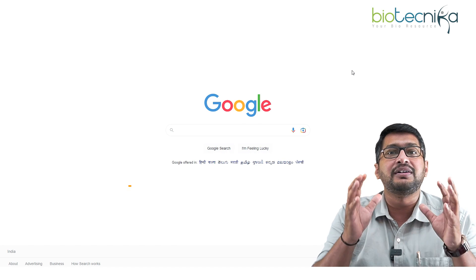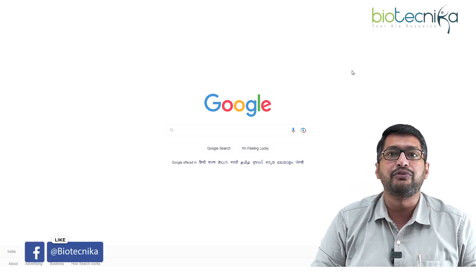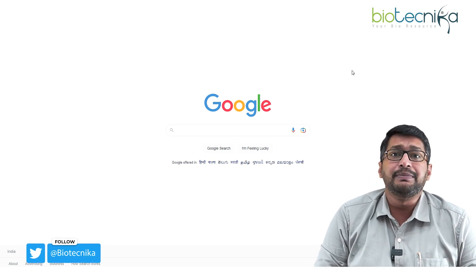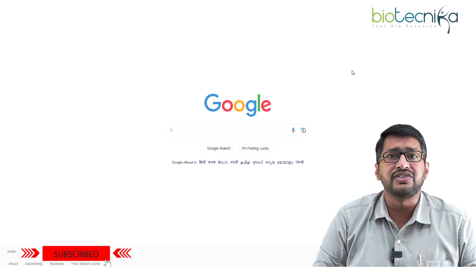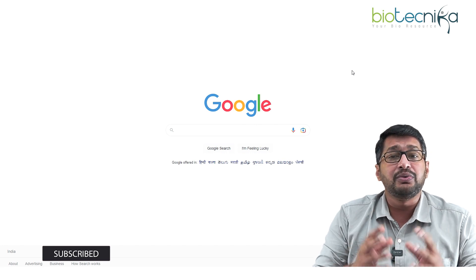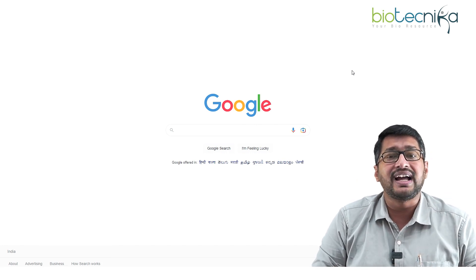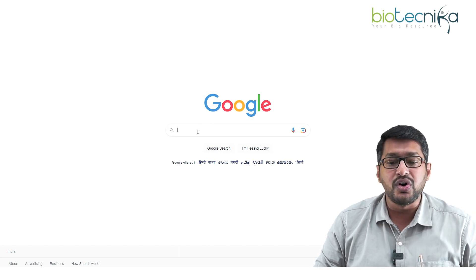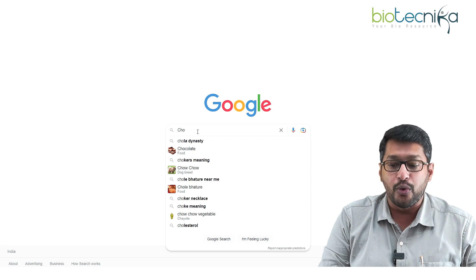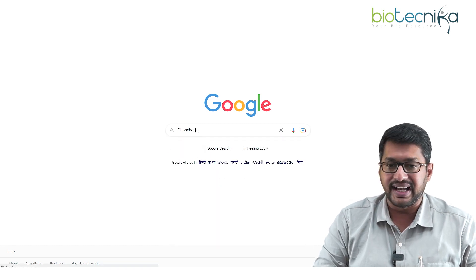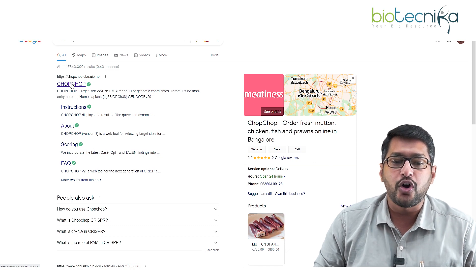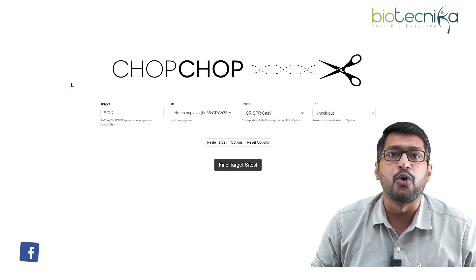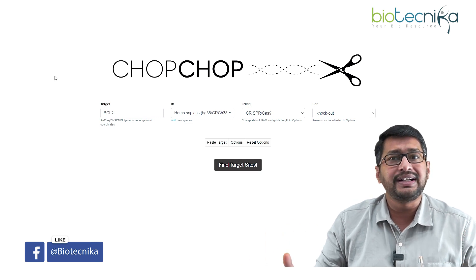CHOP CHOP is a hands-on tool used for designing primers, especially for the guide RNA used in CRISPR. To access it, go to Google and type in CHOP CHOP — it is C-H-O-P-C-H-O-P — and navigate to chopchop.cbu.uib.no. This is the home page of CHOP CHOP.